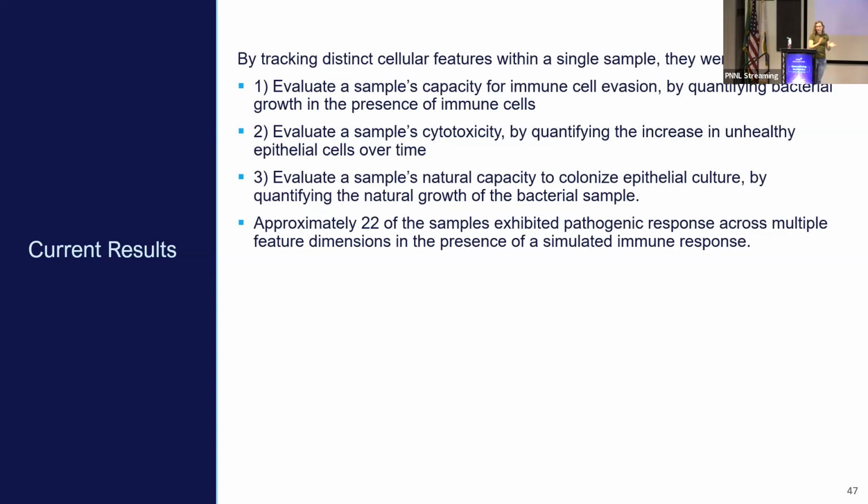A huge amount of data was able to be run through from actual permafrost samples. I have it kind of summarized here, the kinds of measurements that they were able to look at. Overall, they were able to narrow down from a vast amount of bacteria, filtering for phenotypes and then imaging those suspected pathogenic bacteria down to 22 potentially pathogenic when compared to the reference standard, and then go do DNA sequencing from there.